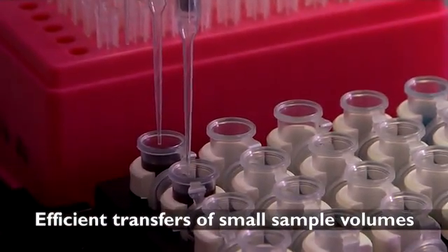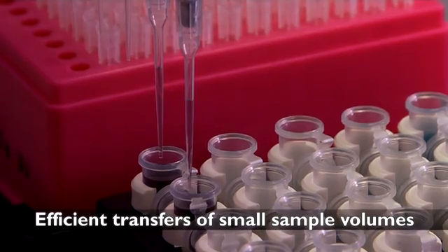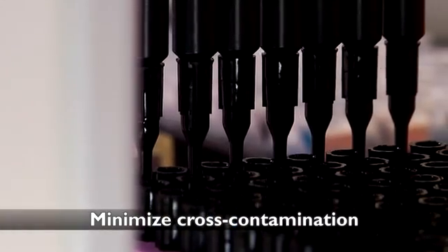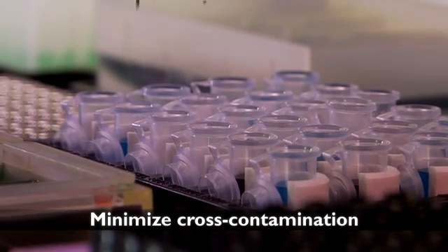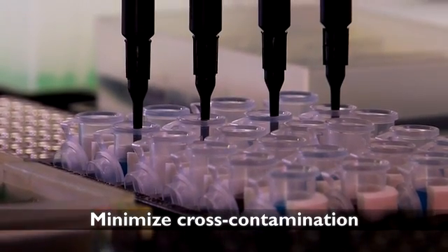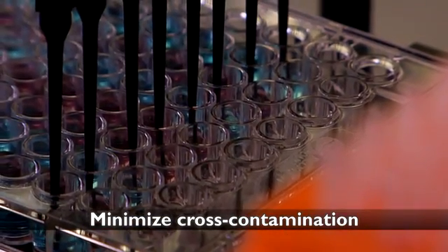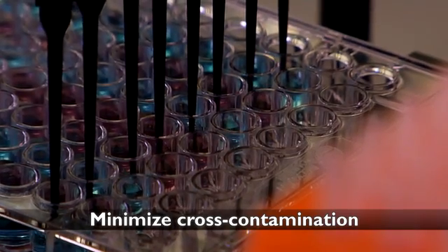It enables efficient transfers of small sample volumes characteristic of assay miniaturization. The SPAN 8 P50 Conductive Tip enables the liquid level sensing capability of the Biomech system to automatically sense the sample or reagent in a well or a tube, so you don't have to specify volumes. And they minimize cross-contamination by reducing the exterior wetted surface of the pipette tip.